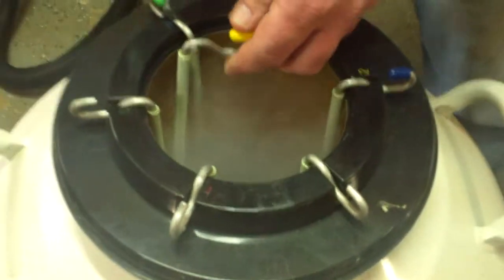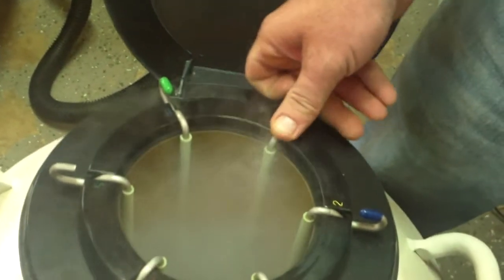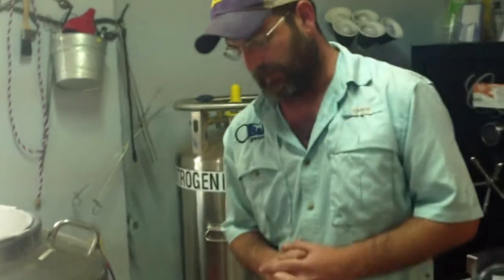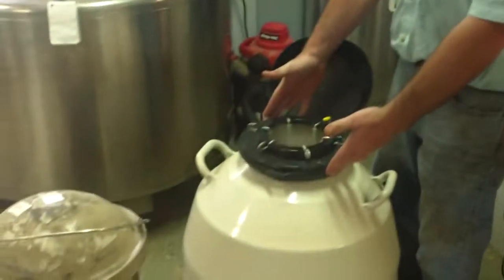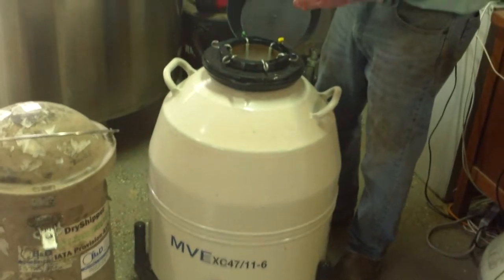We can see that tab says 'Artemis' on top, and we can look a little further. We have a semen tab — the aluminum part is called the cane, and then the goblet. The straws are actually within the goblet, seated on a shelf on the actual aluminum cane. This is a fairly large semen tank — you can see it has a roller base on it, and it'll hold around 2,500 to 3,500 units.